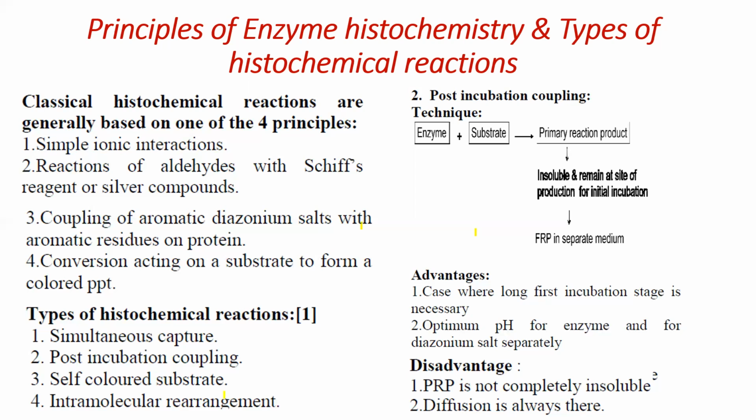But because of their rarity and limited availability, only for a few enzymes are these substrates available. So that's why we are going with these salt approaches only. This salt can react with any enzyme, any substrate. So we are trying with traditional approaches.